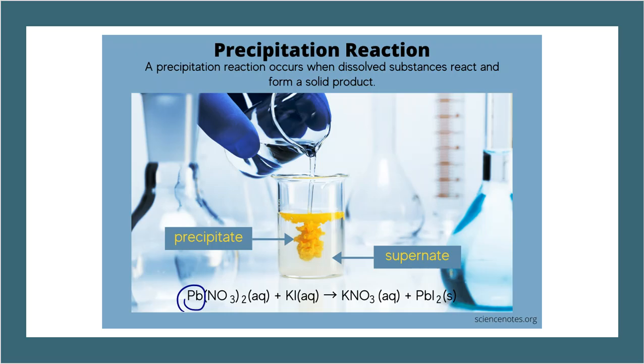That way we can minimize our waste and get rid of a large portion of that volume, that liquid that might be in the beaker. So if I can remove the lead, then maybe I can do that. This is a solution that will make lead fall out, and when it does, it creates this yellowish type of precipitate. I see it with my eyeballs in the picture. If I allow that to settle, it will settle to the bottom. Or I can put it in something called a centrifuge, and that centrifuge will pull that solid down to the bottom of that container much faster, and I don't really have to wait on it.